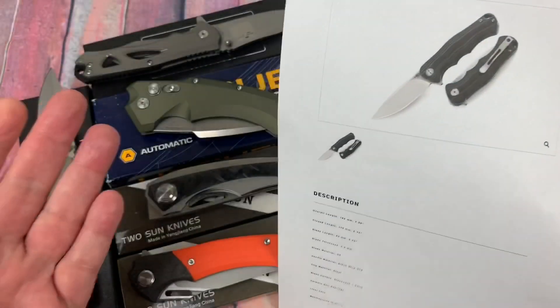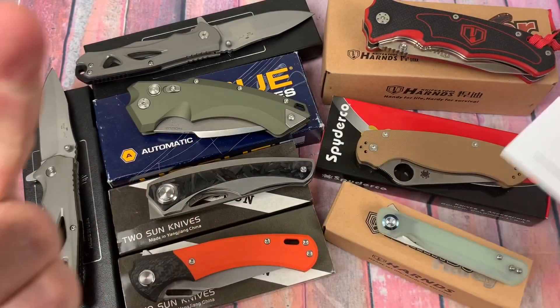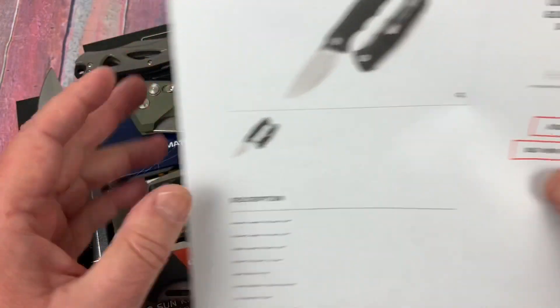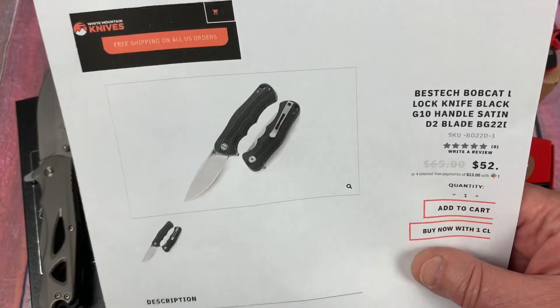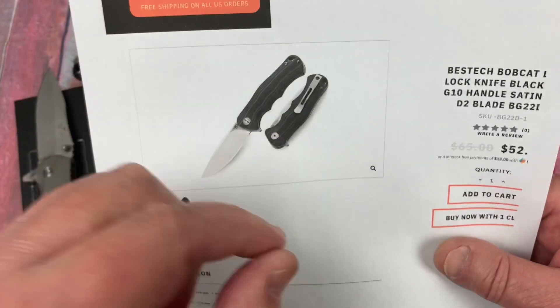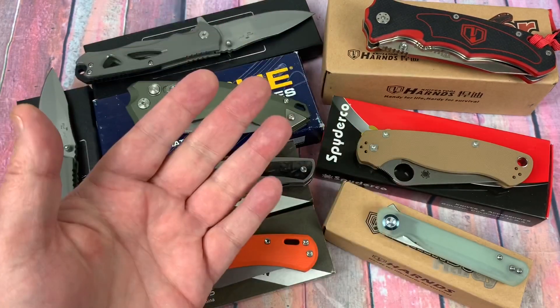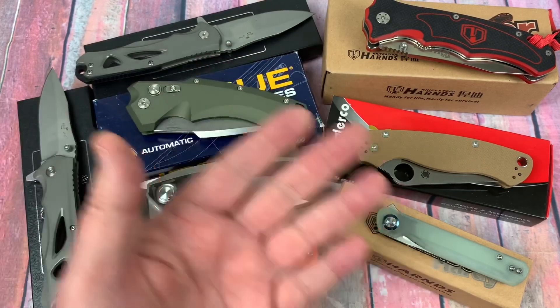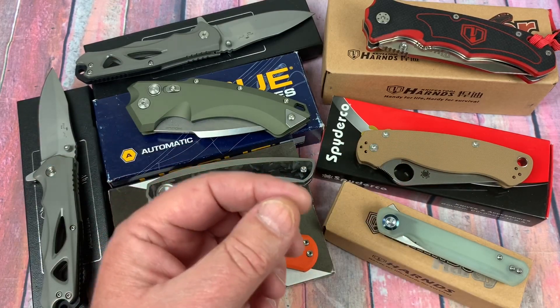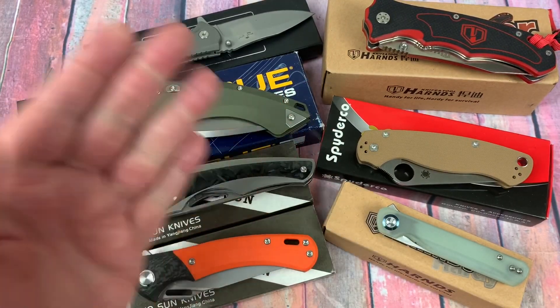The next one was the Bestech Bobcat. We didn't do a PMI on it — we've done PMIs on Bestech M390, their S35VN, their D2, and it's all been true to form on the elementals. So we were just interested in the Rockwell number, and it was 58.2. 58 is kind of the minimum I want my D2 at, but it'll definitely be in the green zone. It's not a 60 or 61 or 62 — I've seen some at 60, 61, even up to 63 — but this is a 58. It's adequate for what I'd prefer personally and definitely in the green zone.